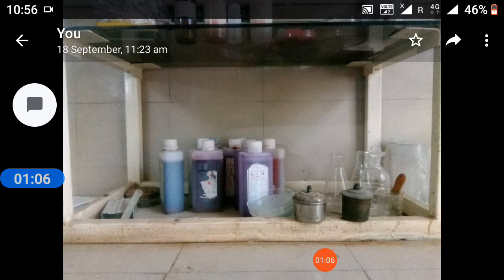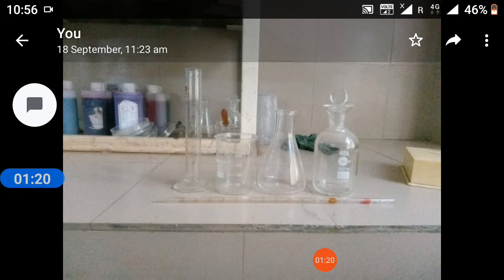When all of the chloride ions are exhausted, the chromate ions react with silver ions and produce silver chromate, which is red. The instant a permanent orange tinge appears in the solution, the addition of silver nitrate is stopped. The final solution color should look like that of orange juice. The chemical reactions are: Cl⁻ + Ag⁺ → AgCl, and Ag⁺ + CrO₄²⁻ → Ag₂CrO₄.